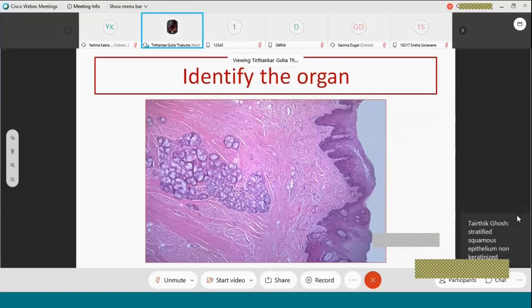Now, then comes a portion where loose tissue is present, followed by some muscle fiber. Look at the density and the stoutness of the fiber and tell me, do they look like skeletal muscle or smooth muscle?